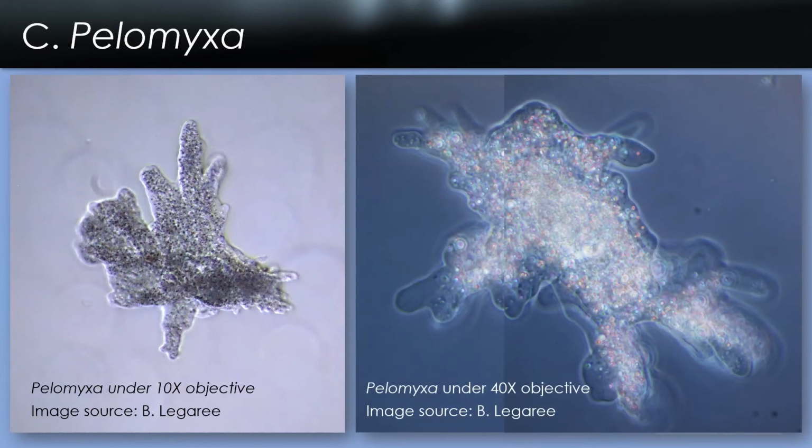Here's another picture I took. This is under the 40 times objective. This was so big I could not fit the entire amoeba under the same field of view.